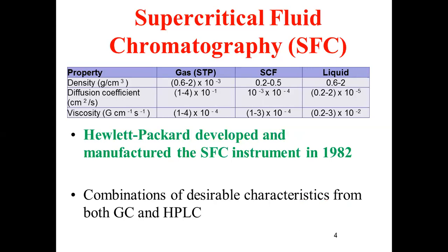And the diffusion coefficient of supercritical fluid will be greater than liquids. Therefore, the diffusion of the solute into the supercritical fluid will be more prominent and comfortable. Therefore, diffusion of the solute molecule into the supercritical fluid will be highly excellent. And one more parameter is viscosity. When you look at the viscosity of supercritical fluids, the viscosity is lower when compared to liquids, and therefore the lower viscosity of the supercritical fluids is an added advantage, especially in performing the separation process by using a supercritical fluid as a mobile phase.